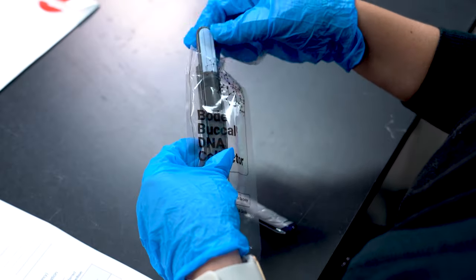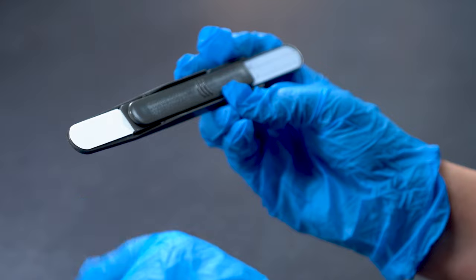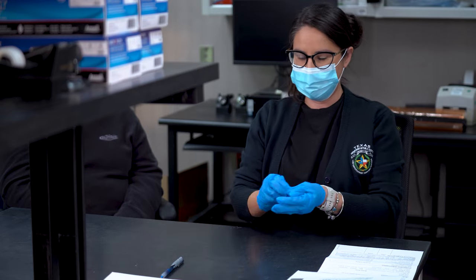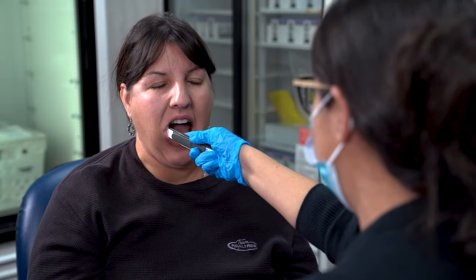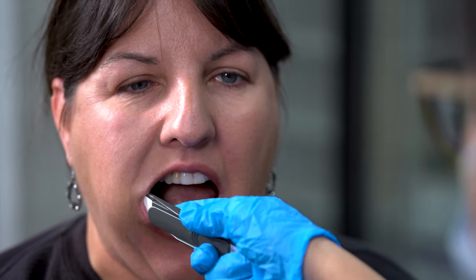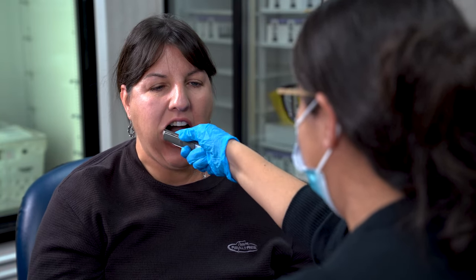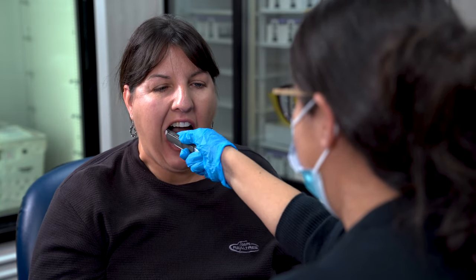When removing the collector from the plastic, avoid contacting the collection surface as this may contaminate the sample. If you make accidental contact with this area, discard the collection kit, discard your gloves, and start over with a new kit. Ask the subject to open their mouth. Place the collector inside their mouth with the collection paper surface pressed against their inner cheek. Apply enough pressure to observe a slight bulging in the cheek. Pull the collector toward you with consistent pressure so that it moves along the cheek and fully out of the mouth. Using the same collector, repeat this process seven more times for a total of eight swipes of the cheek.